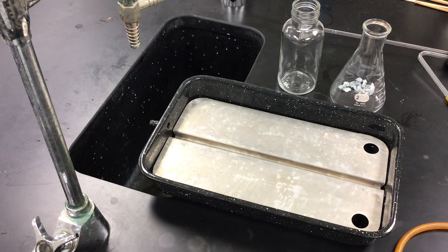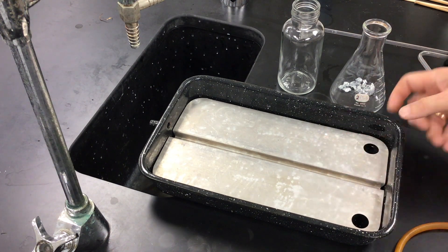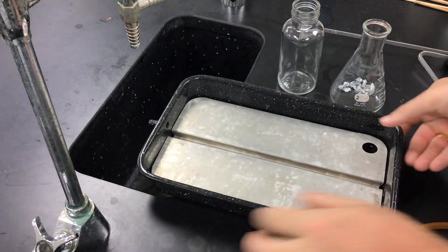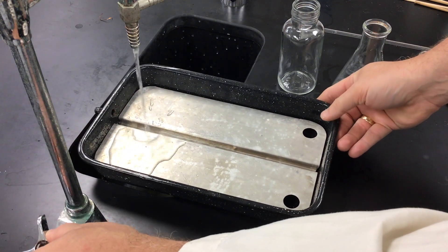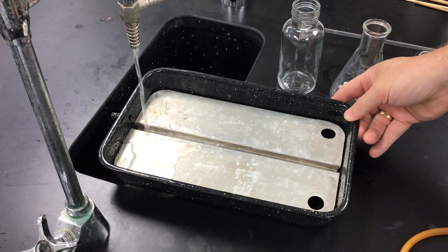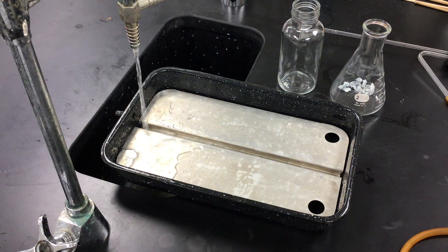We are going to create hydrogen gas and collect it over water in the following procedure. First of all, we have a pneumatic trough — it's a pan that has a groove in it. What we're going to do initially is fill this with water. As it fills, we want to make sure the downspout at the end is over a sink because water will run out.